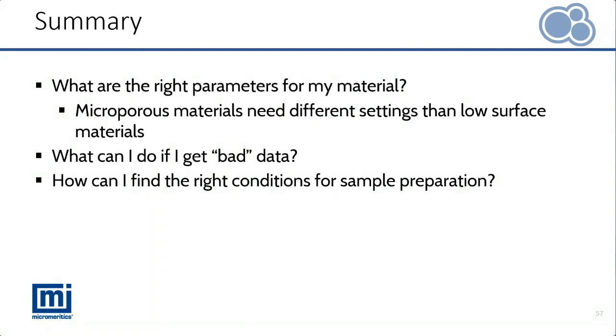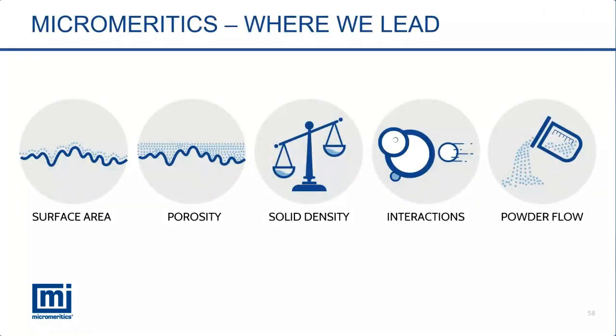This brings us to the end of this webinar. I would say specific surface area is the most widely used parameter to be achieved from gas adsorption. It is used in many different industries as one of the key material characteristics. And it is worth asking the right questions in order to get the most out of your BET measurement. I hope that I could give you at least some ideas and suggestions for answering just these questions. By this, I thank you all for participating, and I'm happy to answer some more questions now.